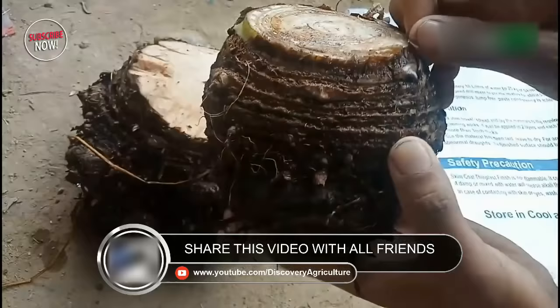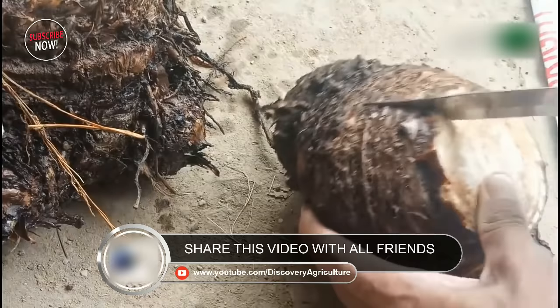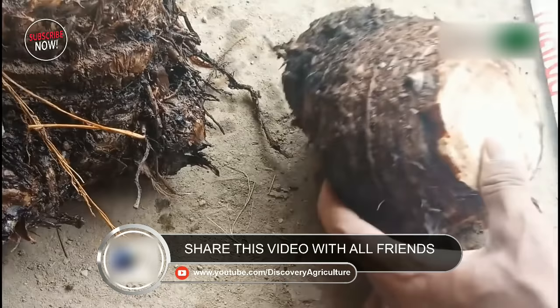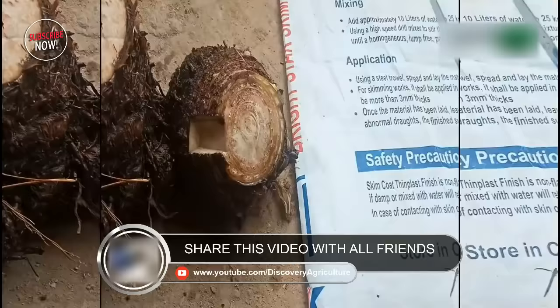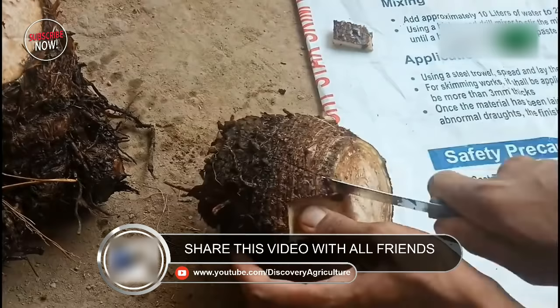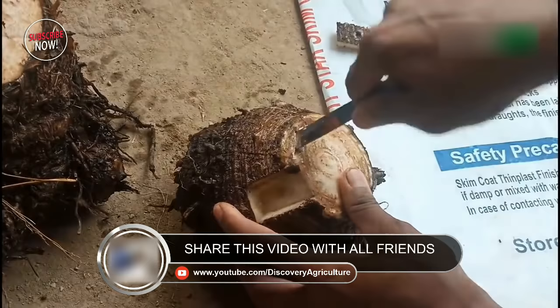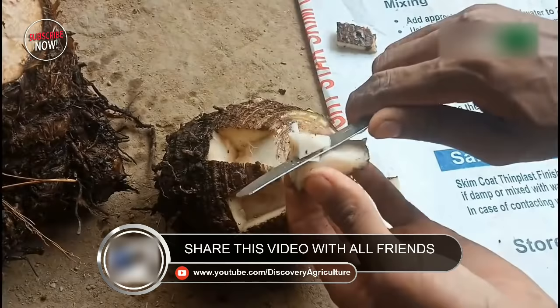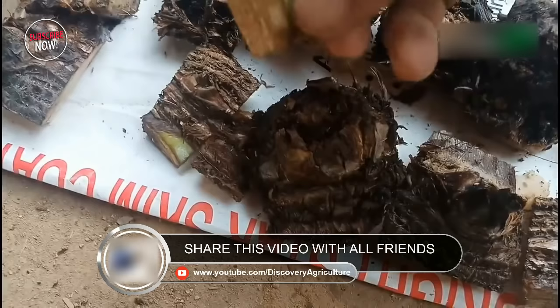Here you can see small buds. We have to take that part out to propagate plant. No need to take cambium part of the corm. Here you can see the bud. It will grow up into the plants.